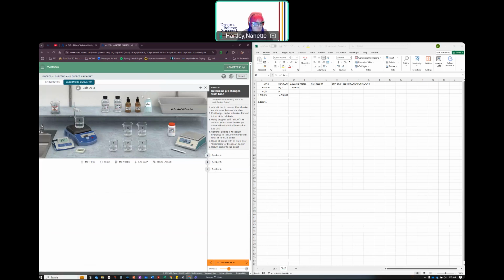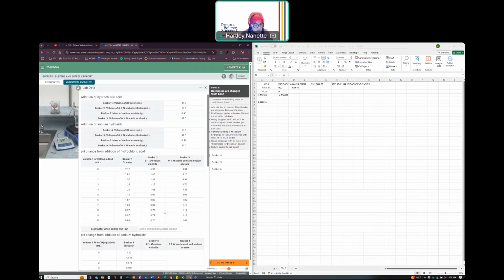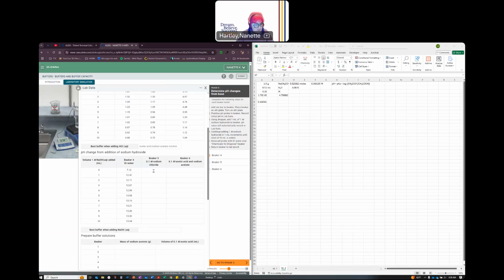Clean that off. Next one. Don't forget to record our initial pH. Initial pH here is 6.92.